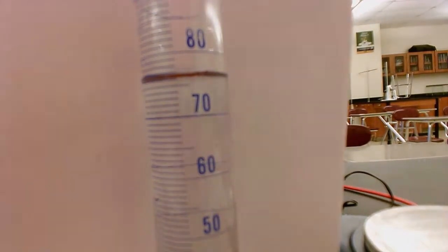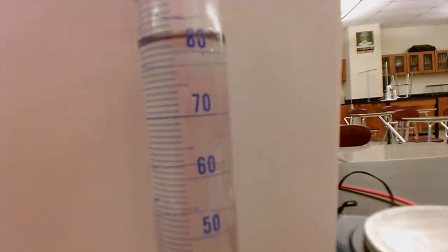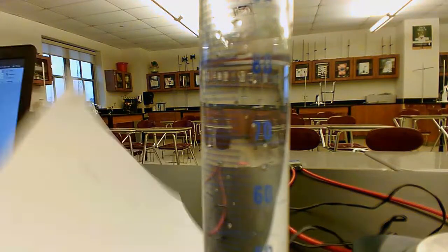Now let's put sample E in. And this is your volume of the water plus solid.